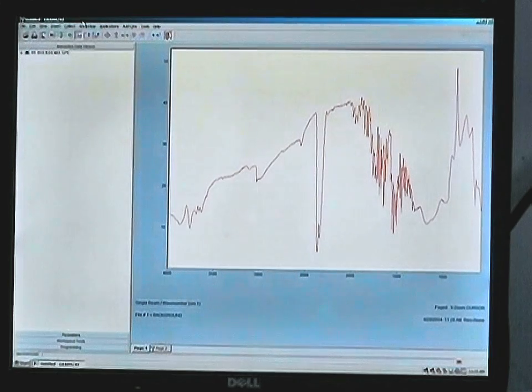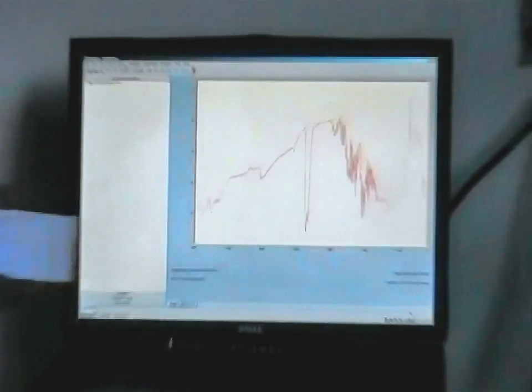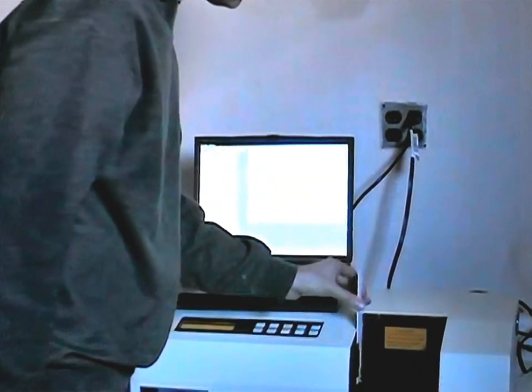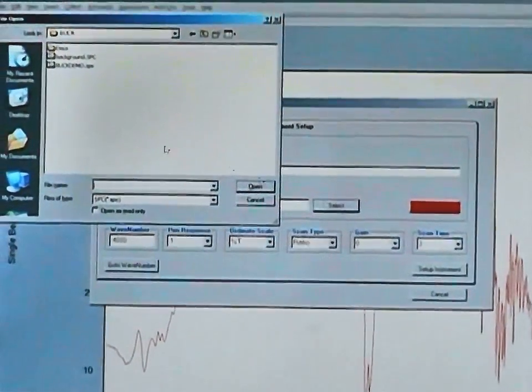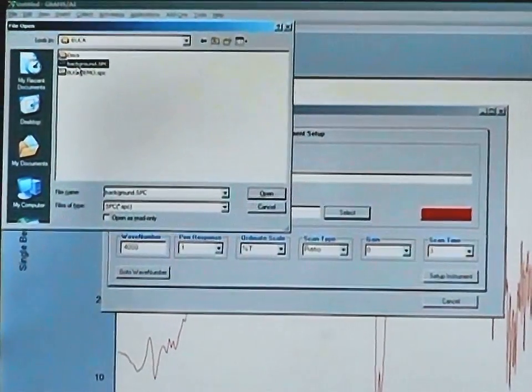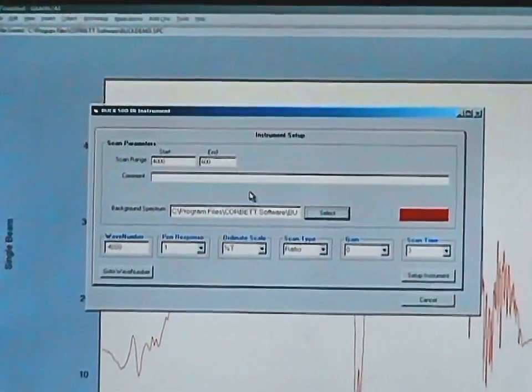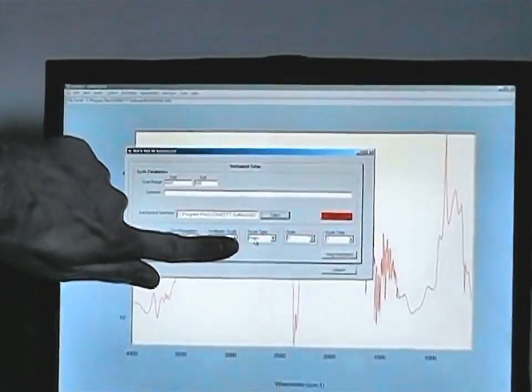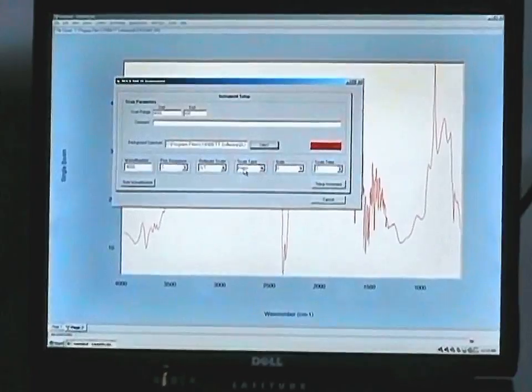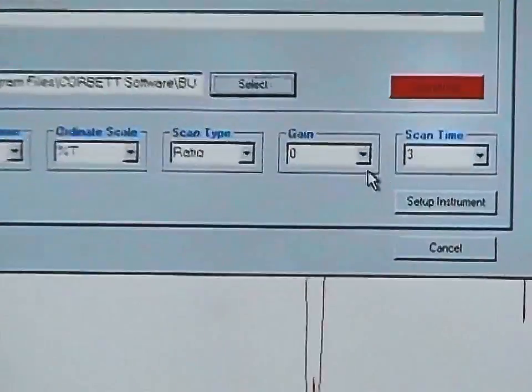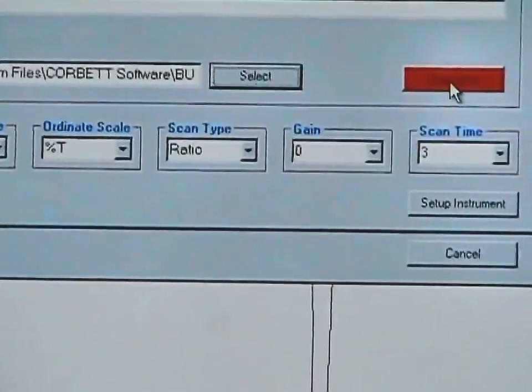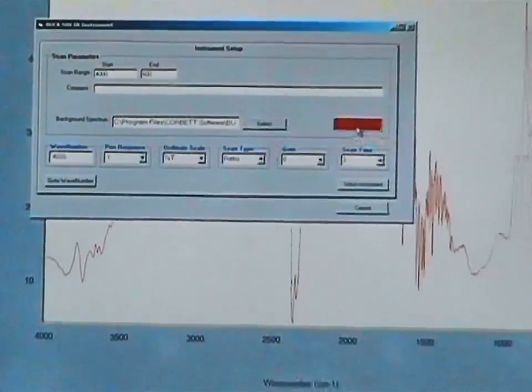Now if you want to run our polystyrene card sample as a reference, insert that into the holder, return to the GRAMS menu, select Collect, Instrument Setup, and now use the browser screen to select your background file which we had just run and put that in memory. We can now see that we're in the ratio mode for scan.